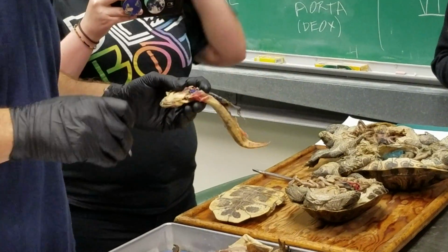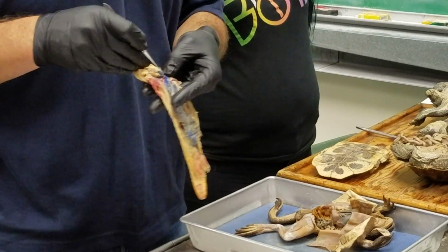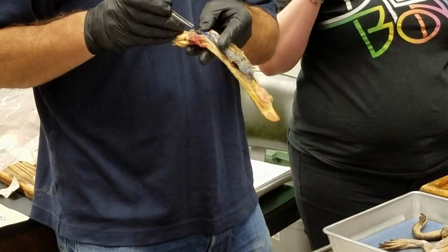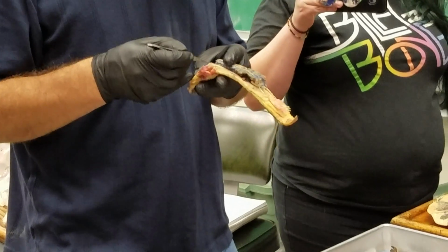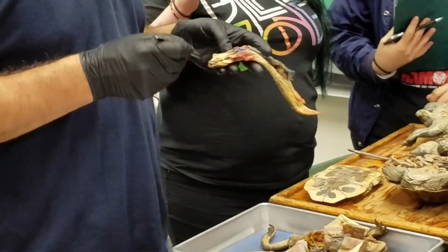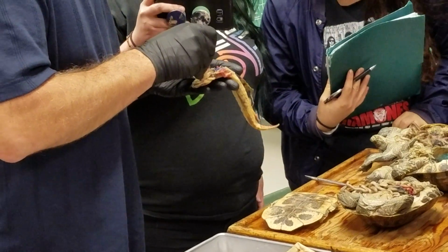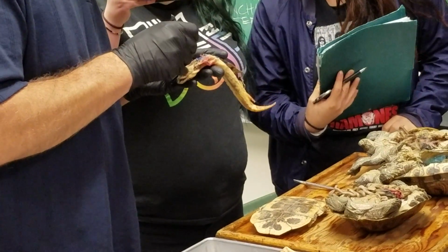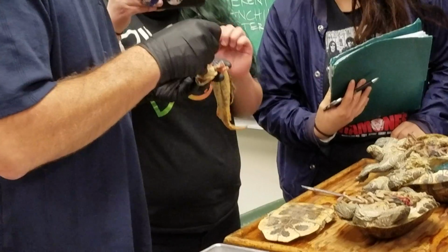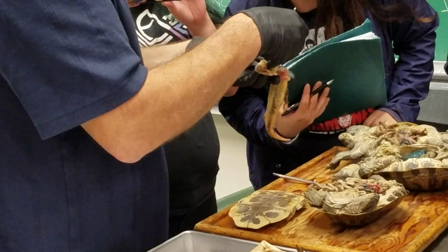All right. There's also an atrium, which you can see kind of off to the side of the ventricle here and here. It is partially divided into left and right atria. What's tricky about the heart to understand, and it's been hard for people to find, is coming back from the liver, you have hepatic sinuses. And hepatic sinuses split out on the side here. So this would be a hepatic sinus on one side, coming back from the liver.